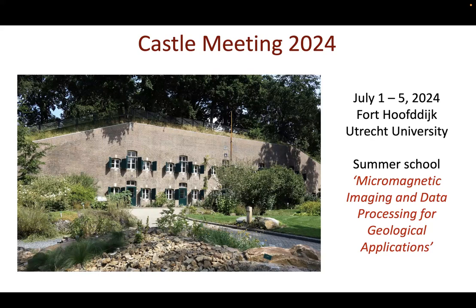And then in terms of a typical sample that you're scanning, how do you get that volume of material? You just measure more and more surface area? Yeah, but the funny thing is that the sample that Marta scanned, the resolution of her micro-CT scan was about 800 nanometers. That was before we found the really nice thing in Oslo.